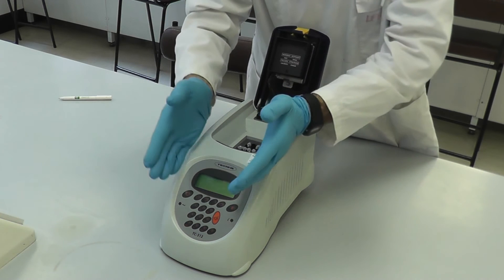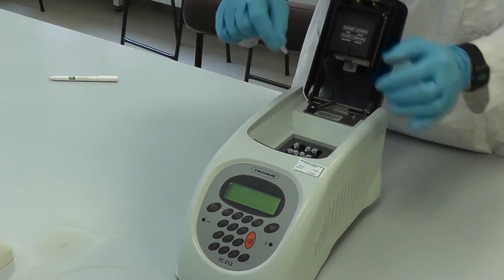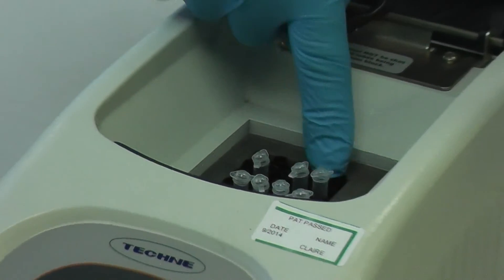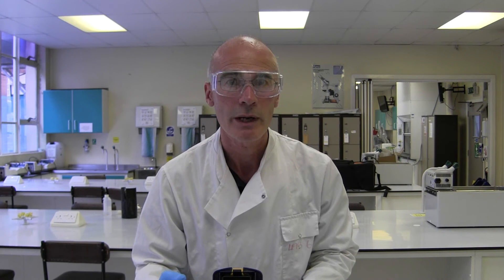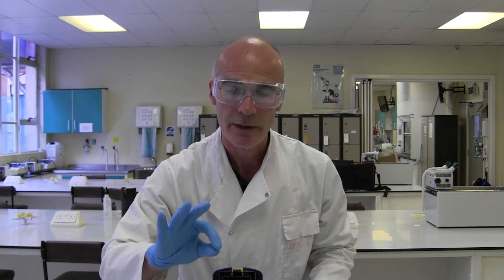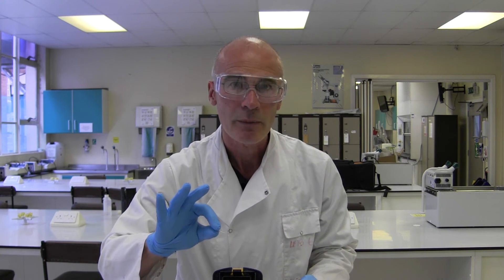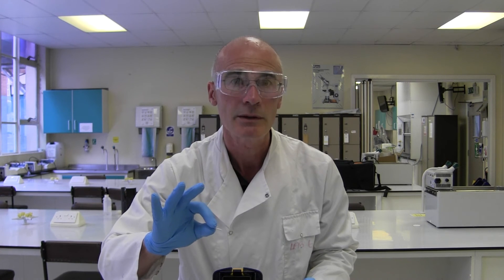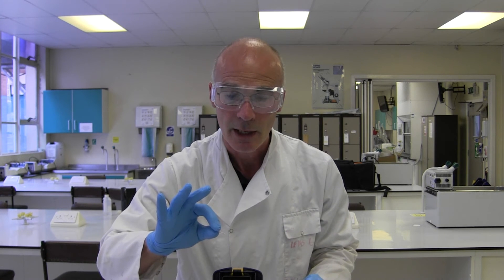Put very simply, it consists of a programmable calculator where we key in the individual cycle times, temperatures, and the number of cycles. The really clever bit though is in the heating block in the center of the machine. This is composed of a novel ceramic material which allows temperature to change very quickly. Typically we'd set up our PCR reactions in these rather small tubes, which reduces the risk of evaporation during the heating cycles and allows us to fit a large number of reactions in any one experiment.